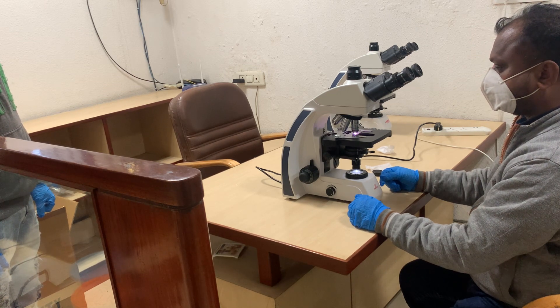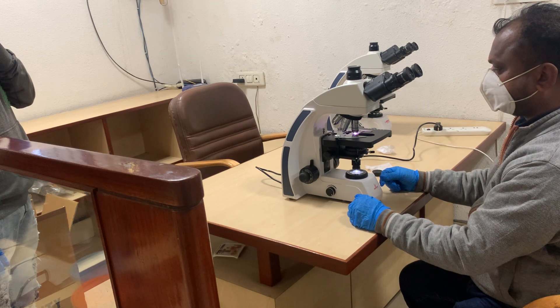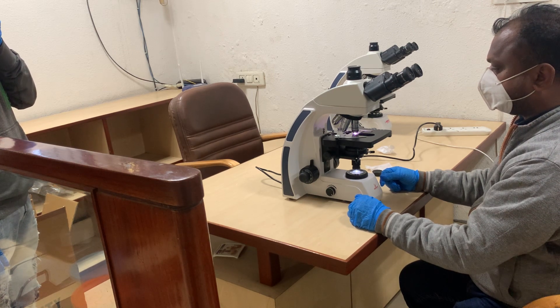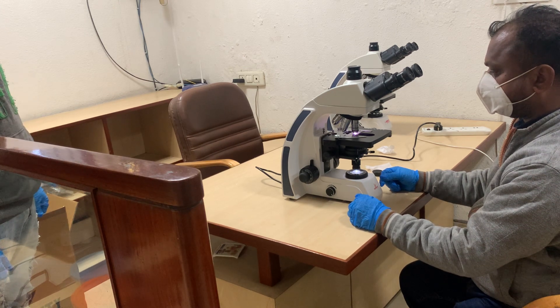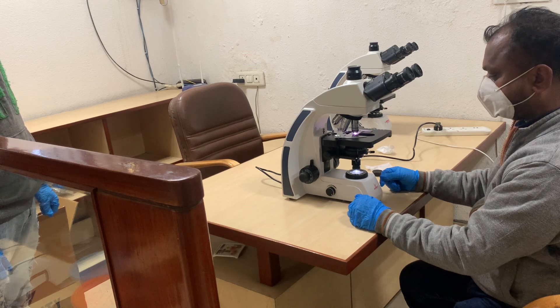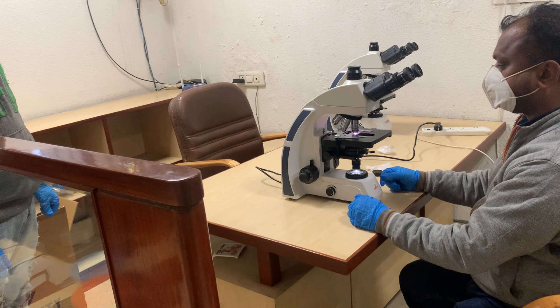It also comes with a quintuple nosepiece, meaning it has a 5-hole nosepiece as standard. We supply 4x, 10x, 40x, and 100x objectives, but there is one extra space available to fit auxiliary objectives such as 20x or 60x.